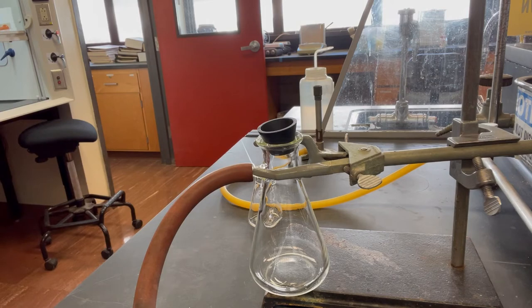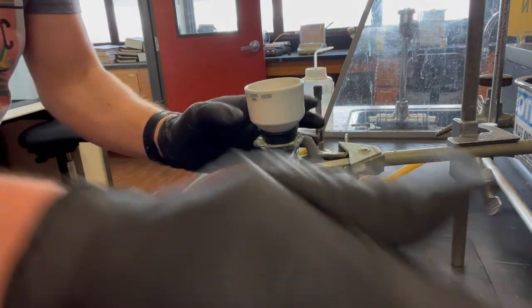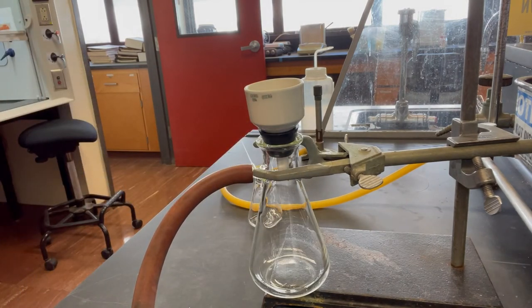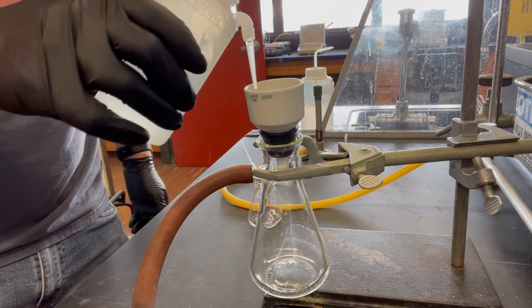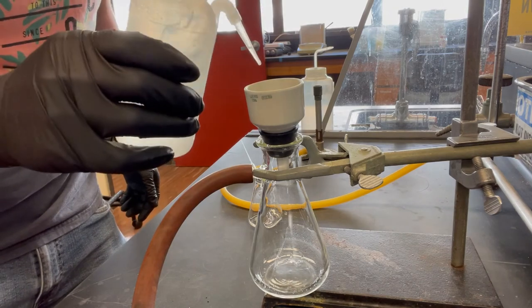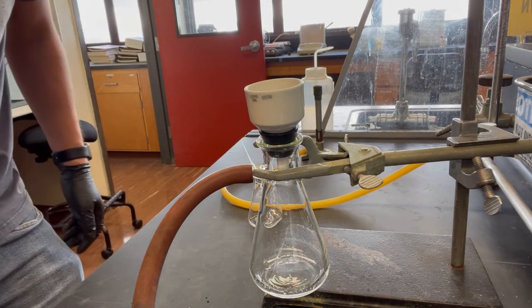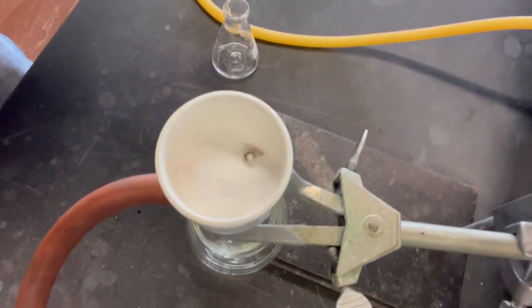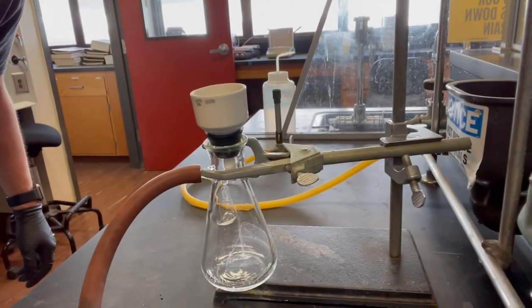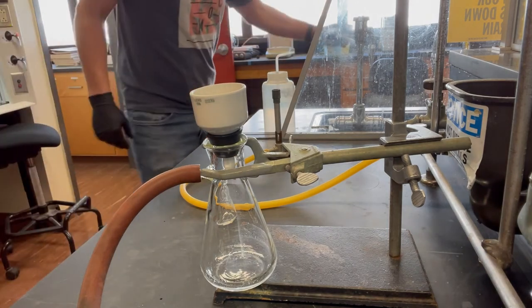Where's our sample? Boom. So this is the poopy brown sample. So I'll go ahead and turn that vacuum on. You saw it kind of suck up onto it. Hit it with a little bit of, maybe like 1, 2, and 3 little squirts. Looks like a good amount of solid still present. You might be able to see that. Yeah, maybe not. But I'm gonna go ahead and do another one.